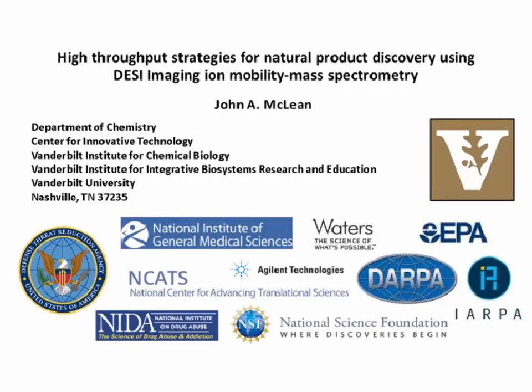So for a number of years, we've been working in the area of untargeted molecular analysis, predominantly in building so-called human organs on chip. Now, the untargeted approaches that we use in those studies are equally applicable in natural product discovery. So for approximately 10 years, we've been working in developing strategies for discovering new natural products, primarily from bacterial systems. So what I'd like to tell you about today are some recent collaborations that we've had with Waters Corporation and being able to streamline and develop high-throughput strategies to make those discovery efforts even more efficient.